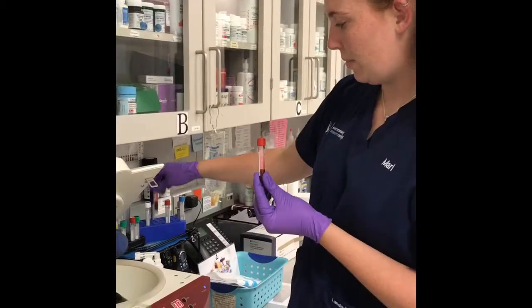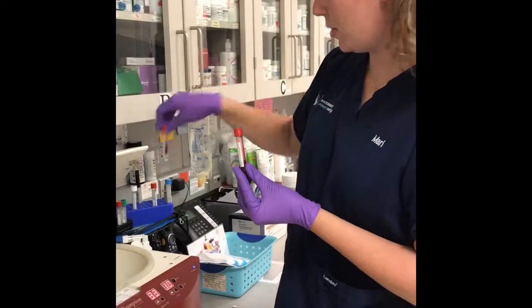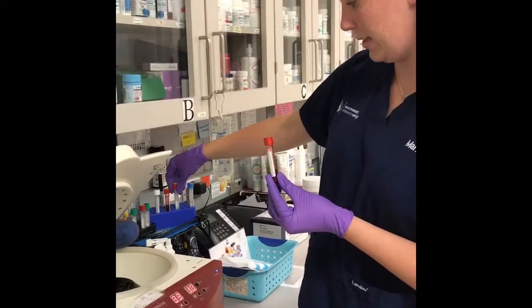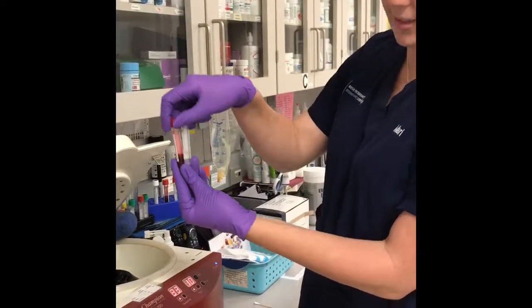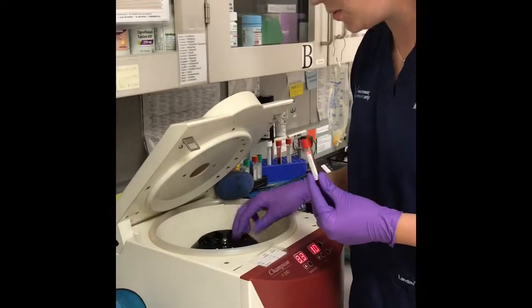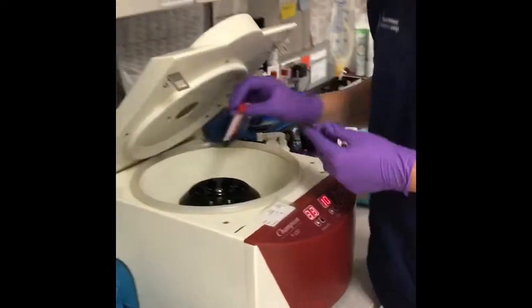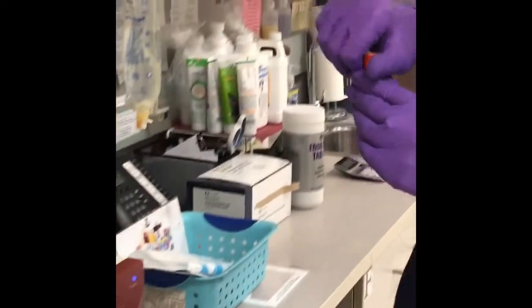Now, even though we did get 2 serum separators, they're of different amounts, so I'm going to use a balancer tube to balance each of them. So as you can see, those are about the same amount. I'm going to place them in the centrifuge directly across from each other. So I place our balancer tube in number 7 and our sample tube in number 3. I'm going to go ahead and do the same with our other sample.